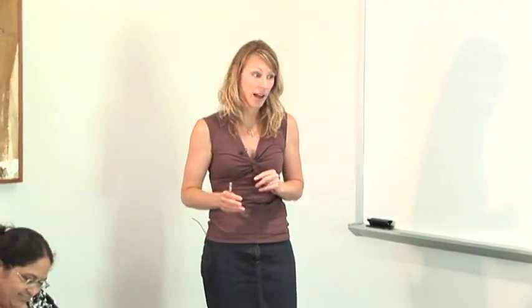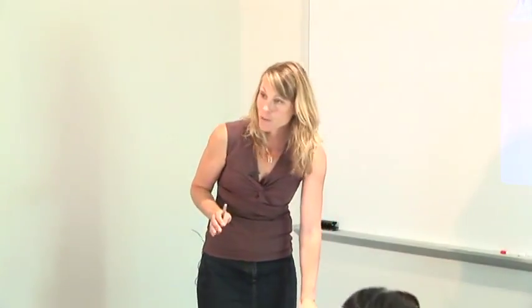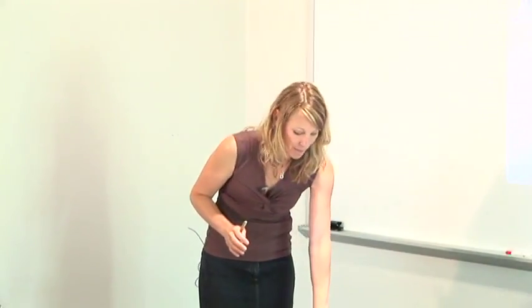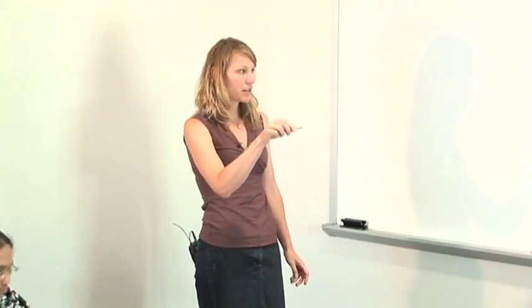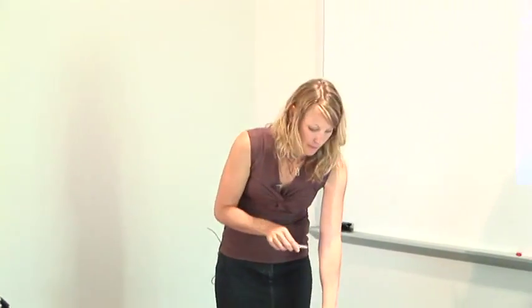You'll get a lot more in the lab this afternoon. Are there any questions before I go on? Okay. So now we're going to talk about the meat of our workflow, our mass spec analysis.